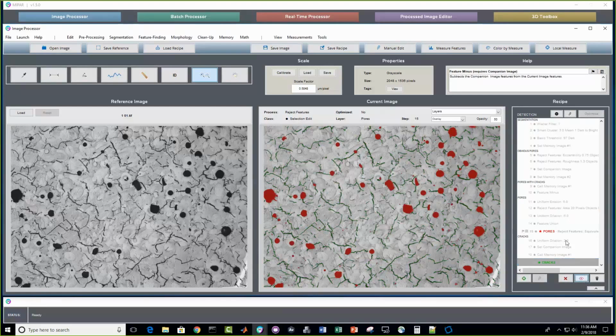And as you saw before, you can show and hide these layers. So layers plus the linear, yet at times nonlinear workflow of the recipe, given the memory step capabilities, really allows you to tackle an incredibly wide range of image analysis problems. So that's a pore crack example. What I'll now do is launch right into quantification, starting with this example.